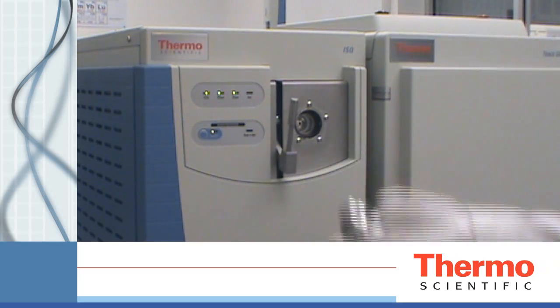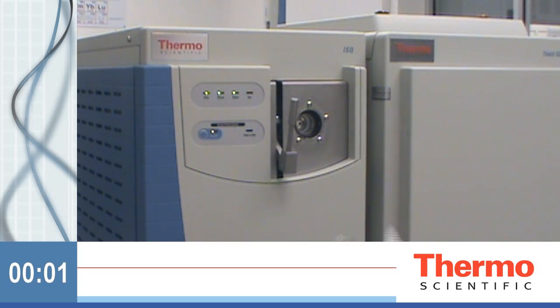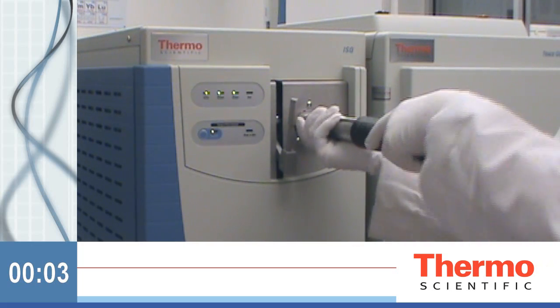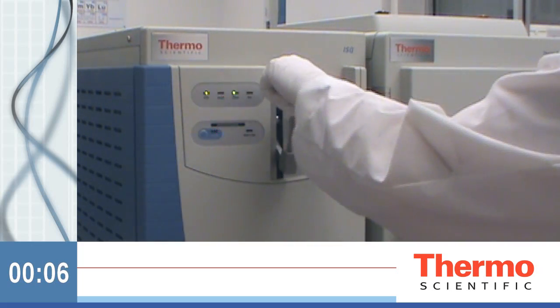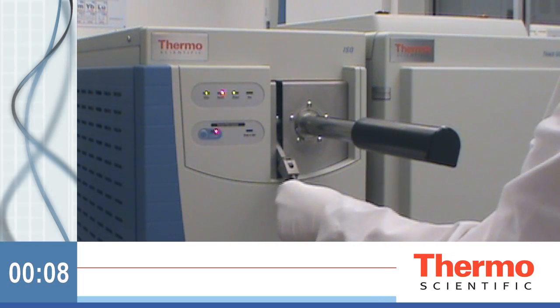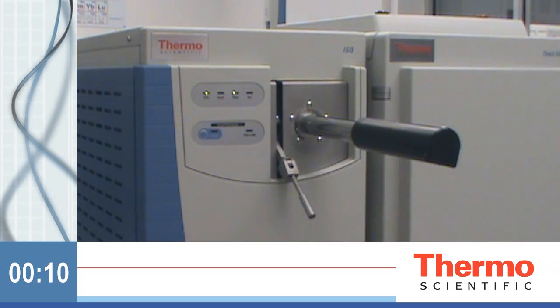Remove vacuum interlock knob. To exchange the ExtractaBrite source, simply attach the source exchange tool and evacuate the small amount of air between the tool and the valve. All source exchange operations take place under vacuum while maintaining temperature set points. You never have to worry about venting your system.